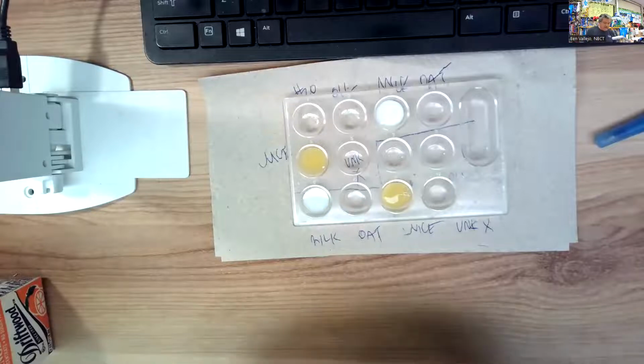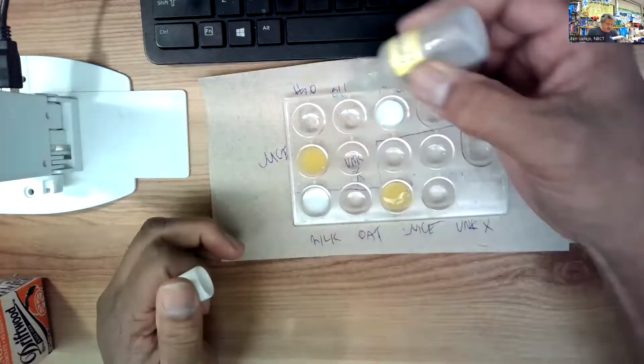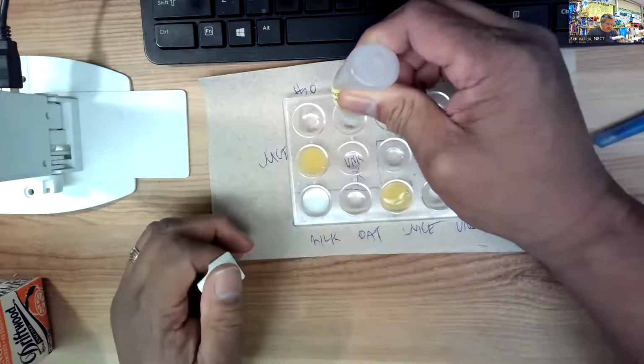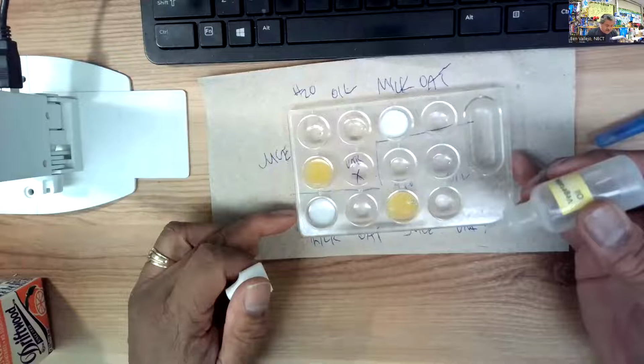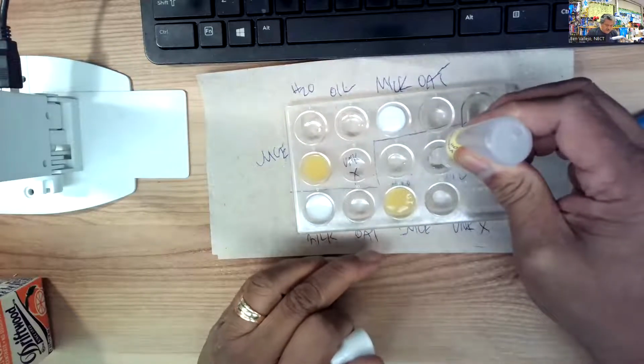All right, for the oil, it gets a little icky, so instead of adding so much oil, I'm going to put 5 drops of oil in there. It will test just fine. 5, and then where's the oil over here? Here's the second one. 1, 2, 3, 4, 5.